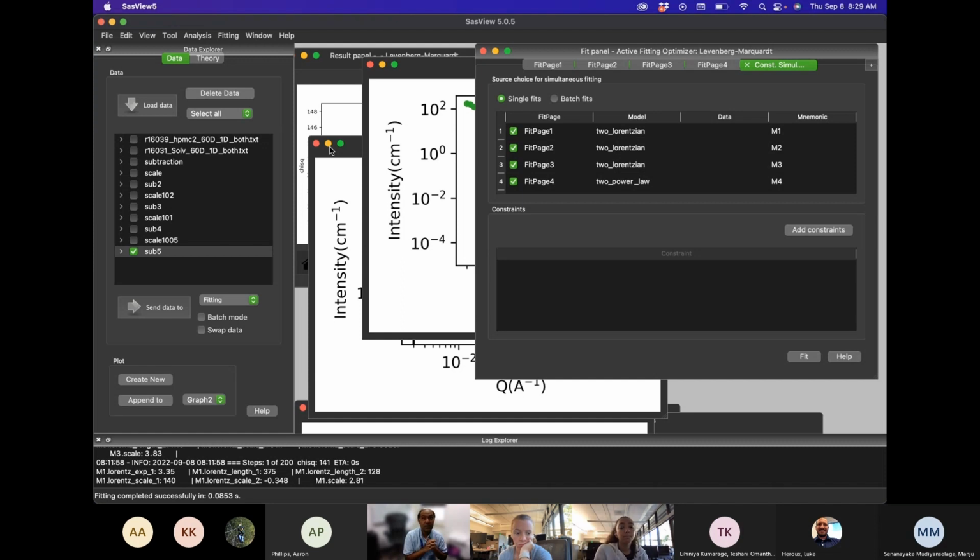Even the effective radius, you can point it to any one of them which shows that peak very well, and then link it to that one. And then when you fit it, you're reducing your number of fitting parameters, but you're keeping the same number of curves that you're fitting. So at least the values of the parameters you get become more consistent all across.